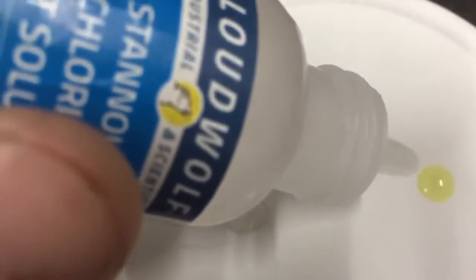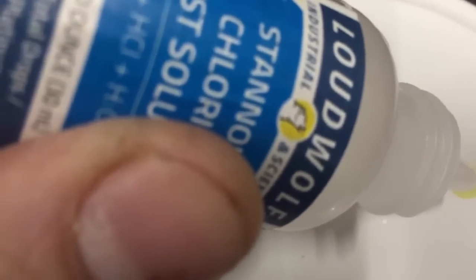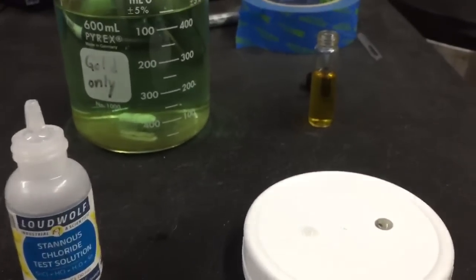Now moving over to the solution known to contain gold — instantly you get the black coloring, showing that that solution does in fact contain gold. So there you have it.